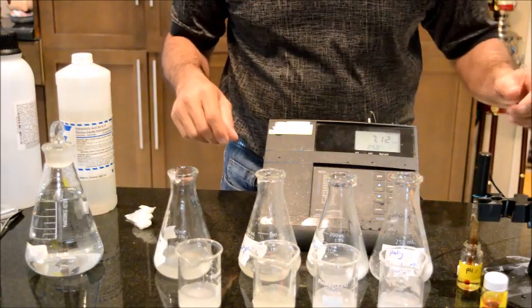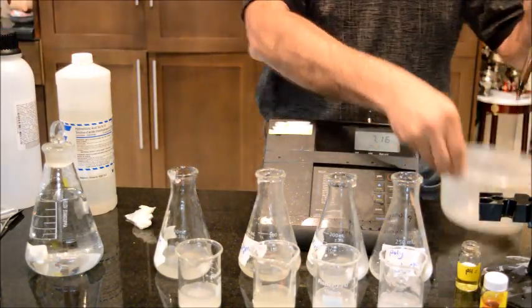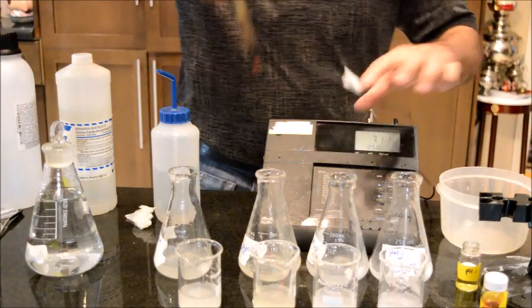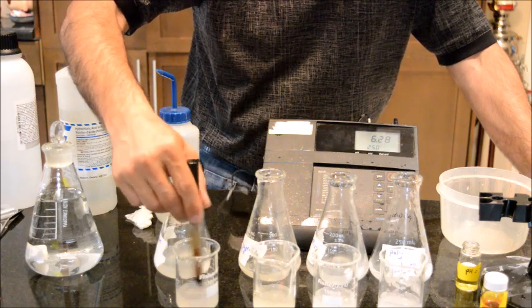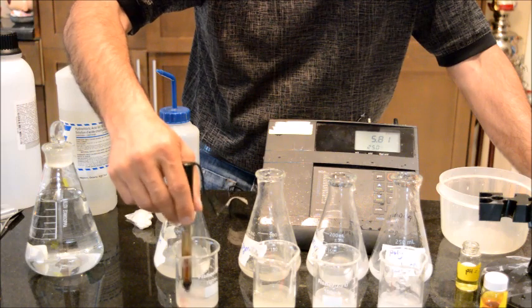Okay, so I will start with the Xanthan gum. The pH of the Xanthan gum 2% is already like 6.2 or like pH 5.8, and it's just dropping.